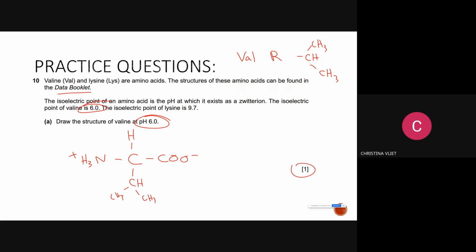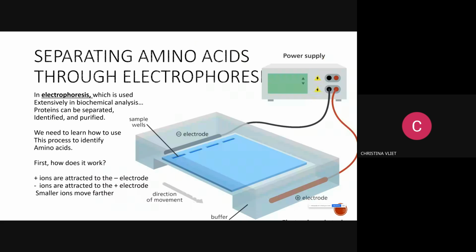Single marks. So with this information, we can start talking about our first actual separation method. This separation method is actually used way more in biology and biochemistry. In the A-level chemistry course, they talk about electrophoresis for only amino acids, but electrophoresis is actually more commonly used for DNA separation. It's how you can tell if you have matching DNA or not. But the concept is similar.